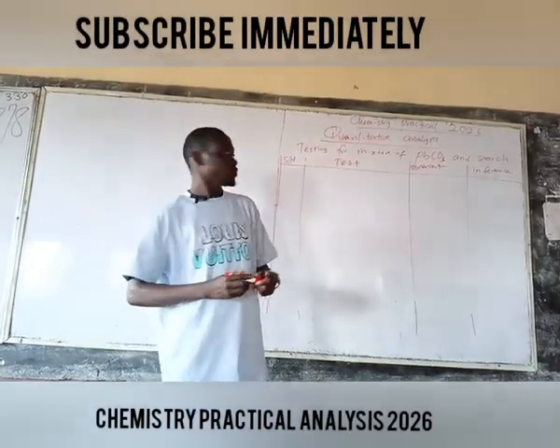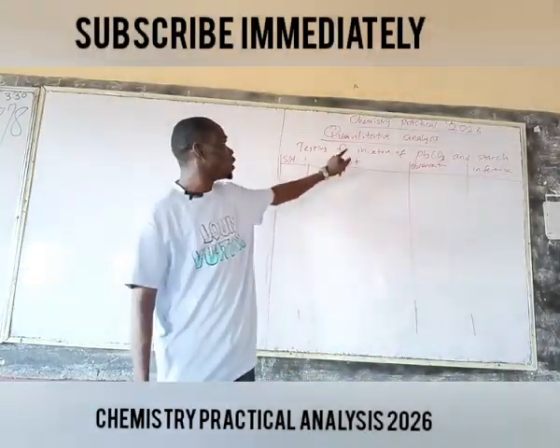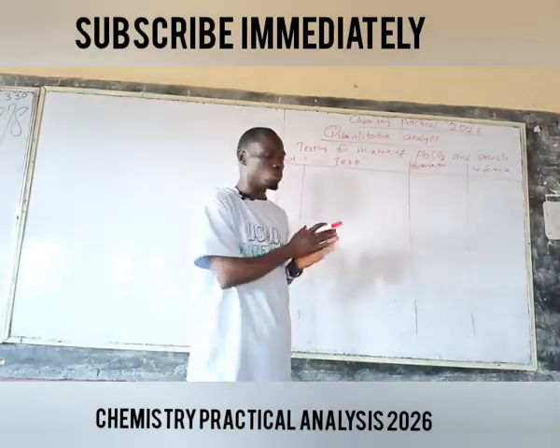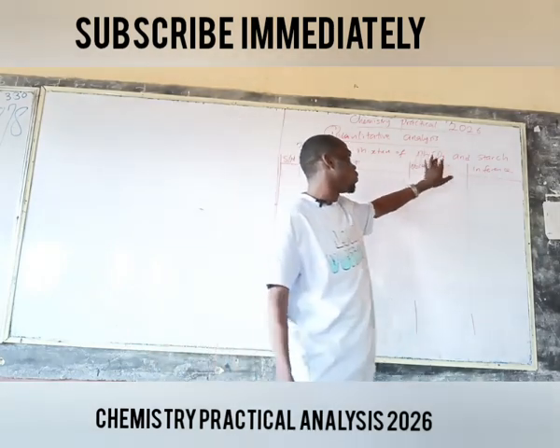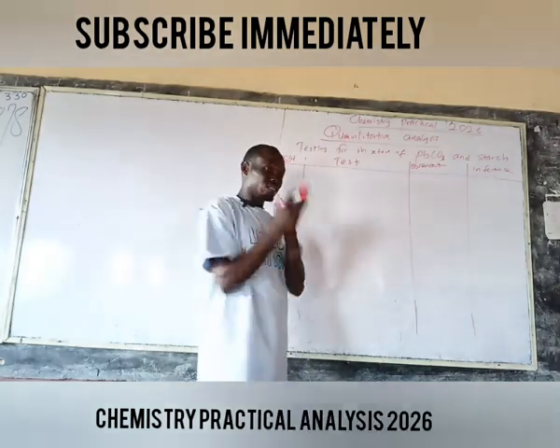All right, to the second part of the analysis, qualitative analysis. This is the most simple part of the work. In this analysis, you want to test for the presence of lead trioxocarbonate(IV) and starch. Lead trioxocarbonate(IV) and starch.